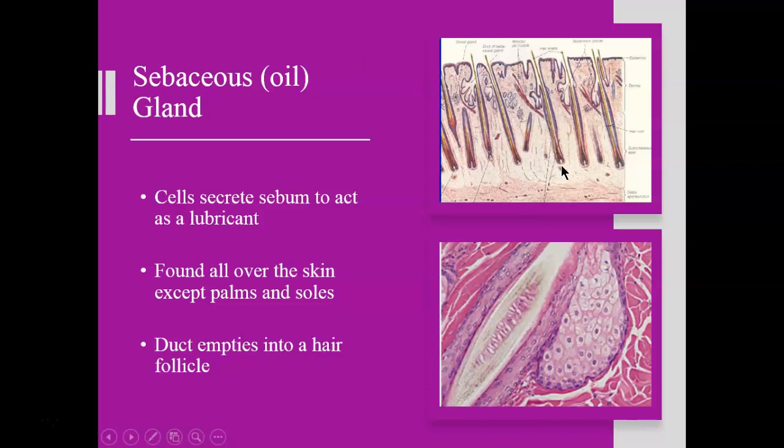So here you can see a hair follicle with a hair shaft growing out. Each one of these is a follicle, hair shafts growing inside. But if you look more toward the superficial surface, where the scalp would be located up here, right? Okay, so this is your epidermis, all of this is dermis.